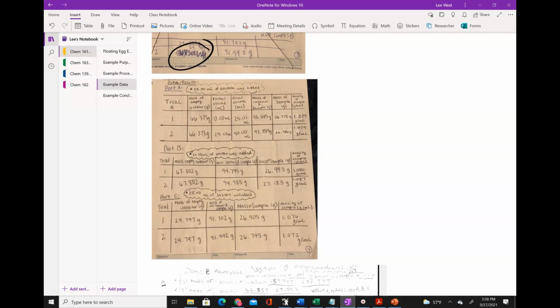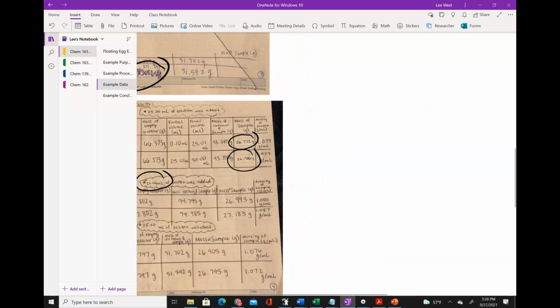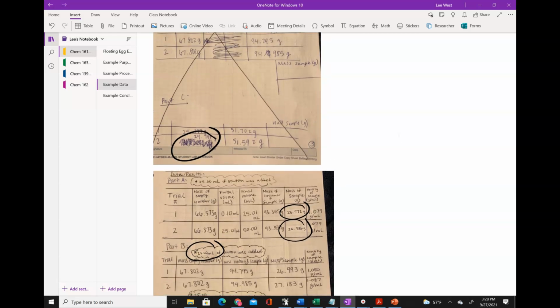And then even when they did rewrite it, they were very concerned about not having any corrections. And you can see in multiple cases, they've used correction fluid. And that's how you end up with folks saying that your results are invalid, or you have to go back and do it all again, just because someone in your lab used correction fluid. It's not considered good practice. So keep that in mind. Again, they did a lot of work here because they did everything twice. If you can avoid doing more than what's needed, that's going to really help.